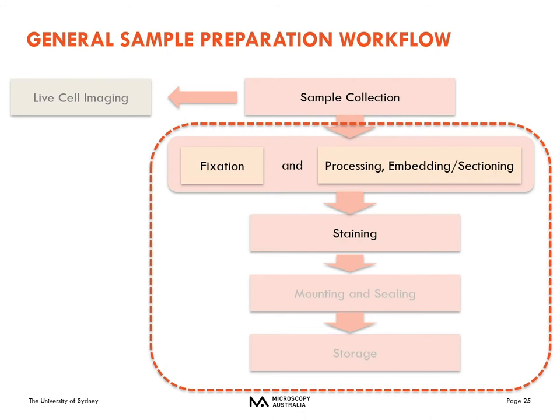After we choose an appropriate method and thickness for sectioning your tissues, the next step is staining. As we mentioned before, 5 to 50 micron sections are often a good choice for most experiments. Anything thicker than that, and you begin to have trouble with staining and imaging, or you will need other advanced techniques such as tissue clearing and multiphoton microscopy. Staining can help to increase contrast and lower the background for light microscopy observation.